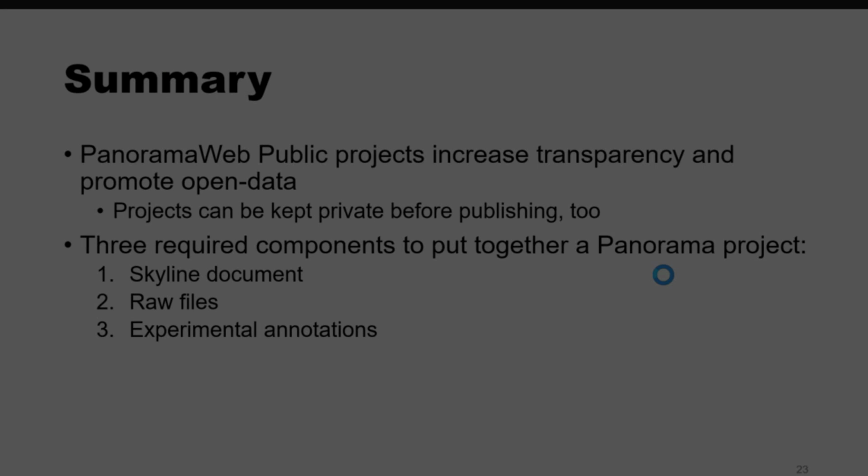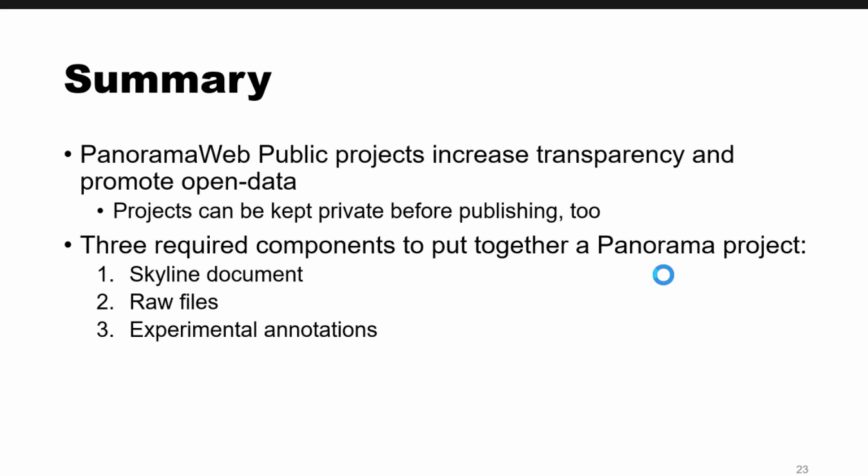Yeah, that was a very brief introduction to Panorama Public for your mass spectrometry projects. It's really nice because I'm a huge believer in open data and transparency, especially as proteomics is getting bigger and bigger data. We have the potential to be putting out more and more garbage.